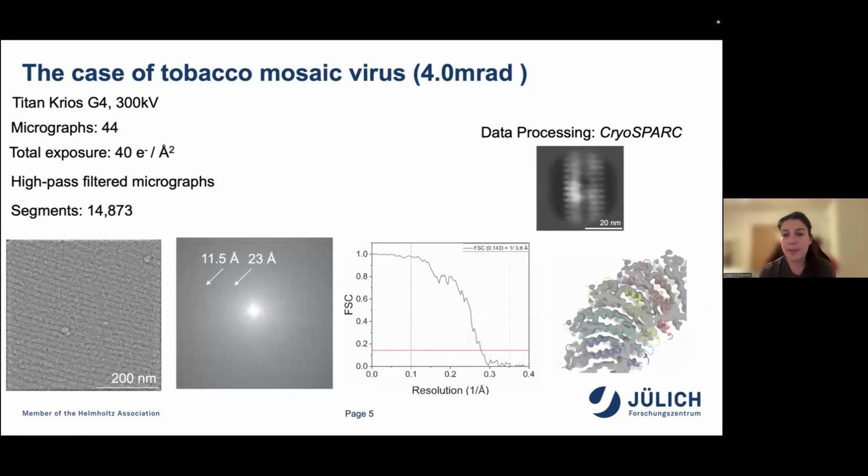The same experiment has been done at 4 millirad. Again, the micrographs have been manually collected, and you can see some details in the 2D structures. And at the end, the final resolution was 3.6 angstrom. Okay, I keep talking about resolutions, etc. We are still at near atomic resolutions, but not at atomic resolutions.